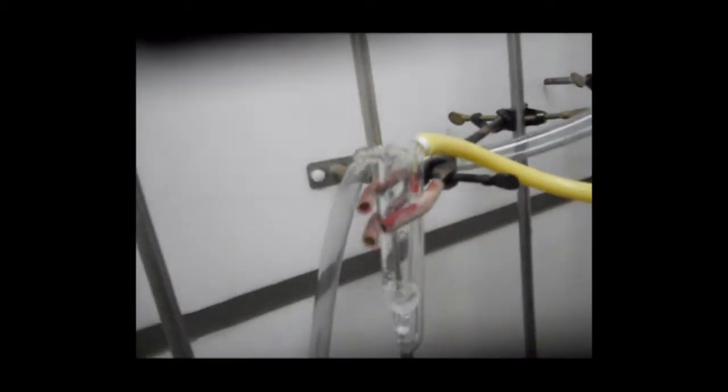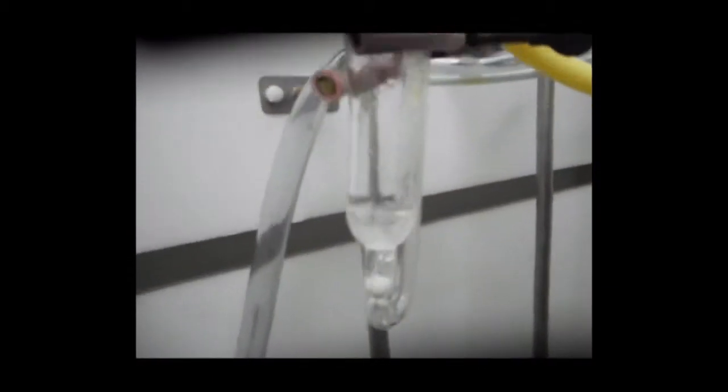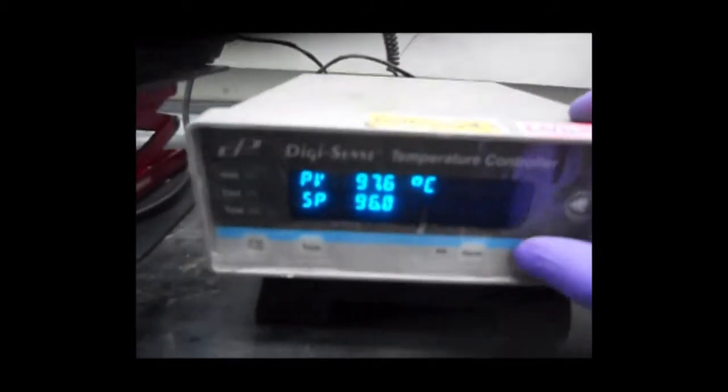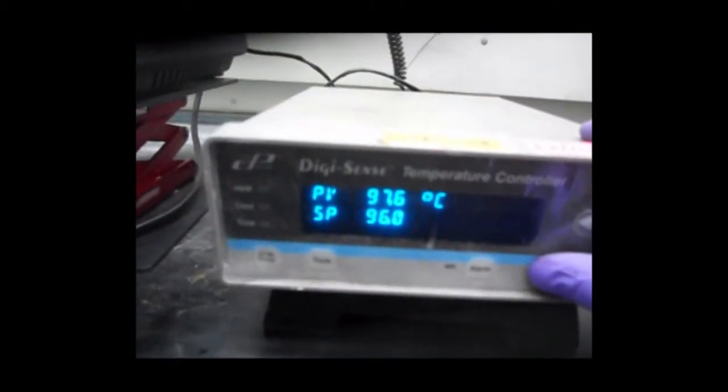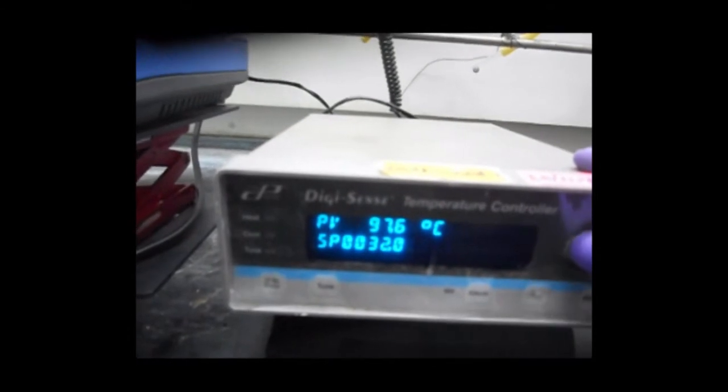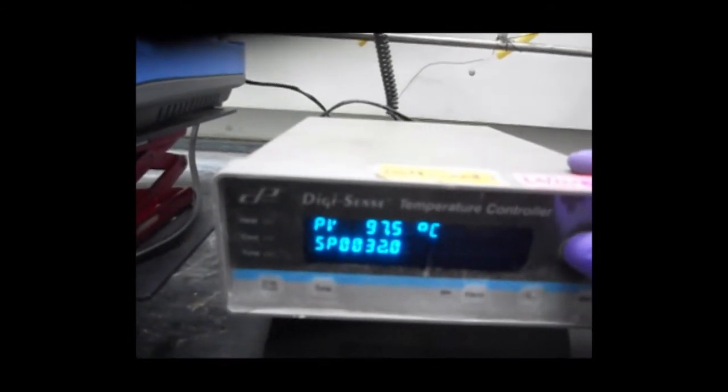We are done with degassing. Now it's time to go to high temperature. We will set the temperature to 320 degrees Celsius. Here I am increasing it to 220 degrees centigrade first, and after it reaches 220, I will set it to 320 again.